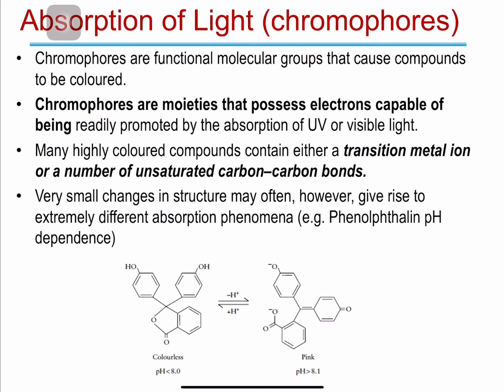Like the complexes we formed in the lab between iron and 1,10-phenanthroline. This is a complex between 1,10-phenanthroline and one of the transition metal ions, which is iron. Or in the first lab, when we did the first experiment where a complex was formed between copper and ethylenediamine.